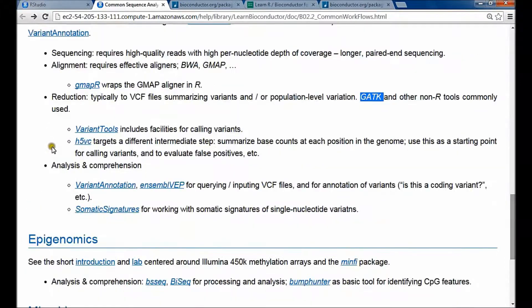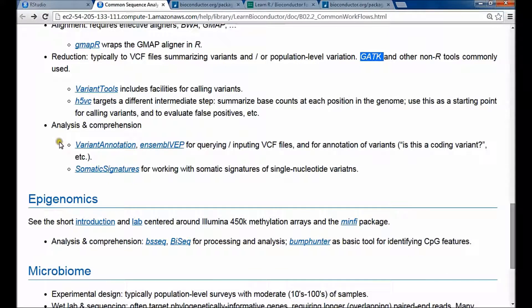Some consortium-level studies generate lots of data, and you need to think about the analysis and comprehension of the variants you've called. So you want to take the VCF file and ask questions about the variants: are the variants close to genes? Do they cause changes in coding sequence or introduce stop codons? What can be said about the variants per se?